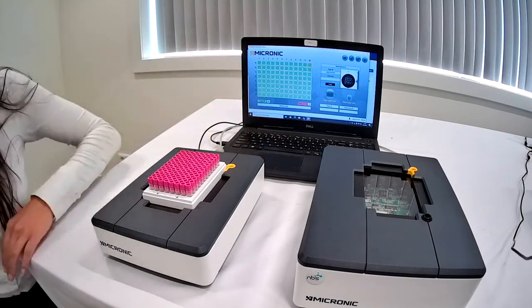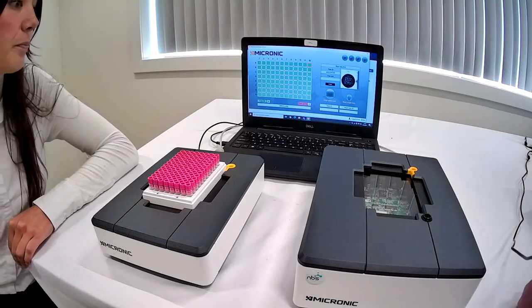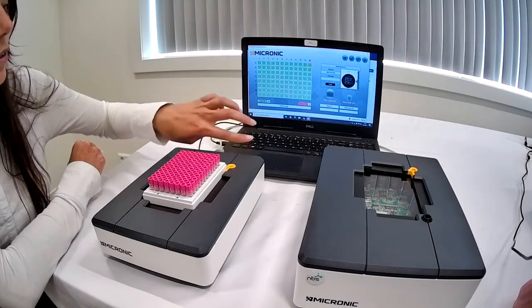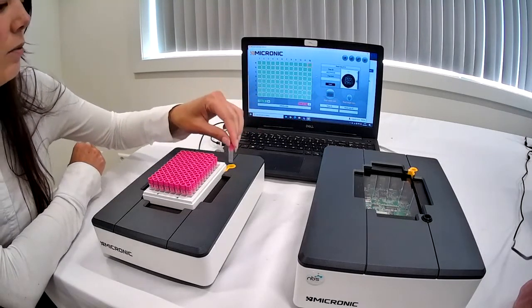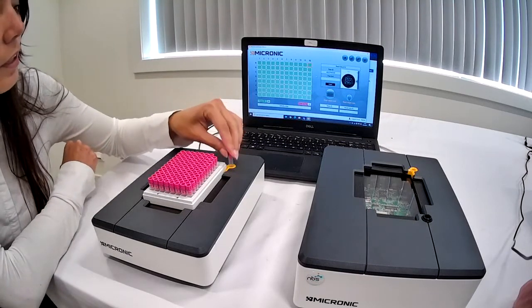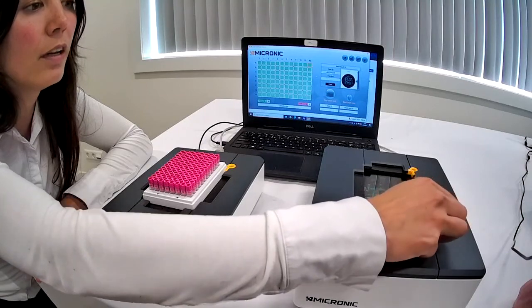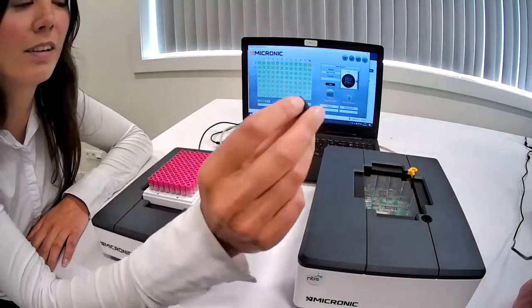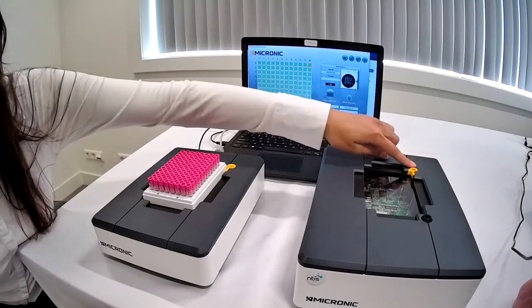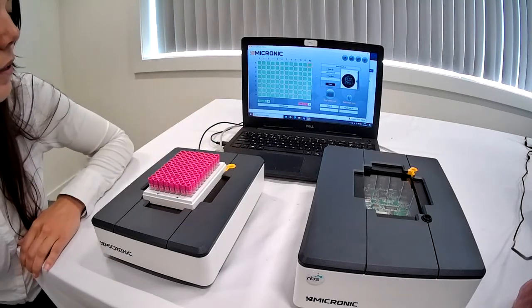You can transport this information into a CSV file, and you can use that in your system or in your LIMS system. The other thing that the scanners have is a single tube scanner. Then the scanner only goes a little part so that it can scan this single tube within a second. You put it inside this yellow hole for the DR500. In the DR700, it is on the right bottom. This also has an option to scan 48 and 24 by removing these black things. And here you can also see the yellow hole. This is done because it gives the A1 position of your rack, so that you always place it correctly on your scanner.